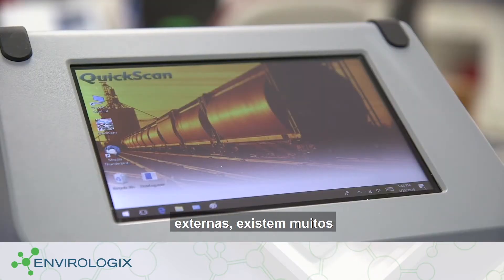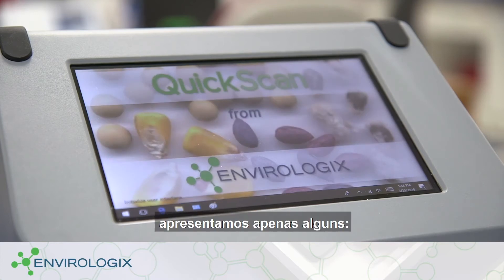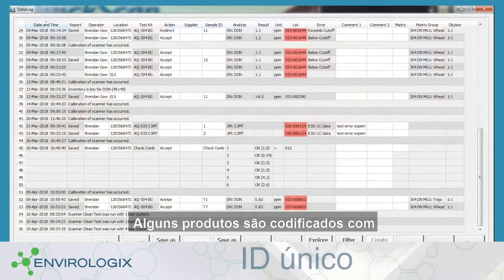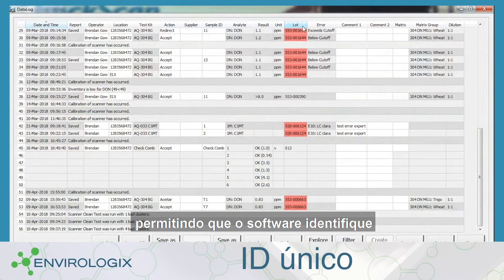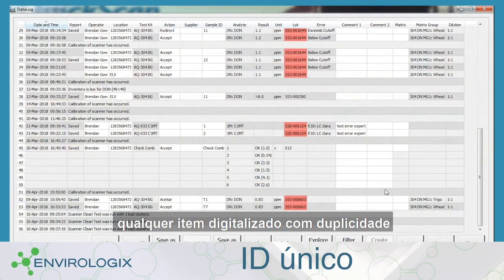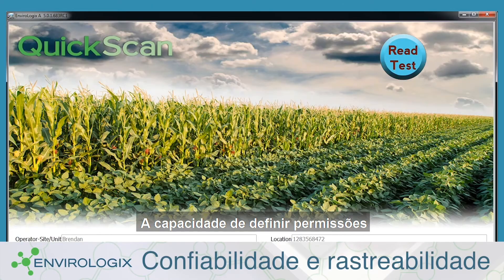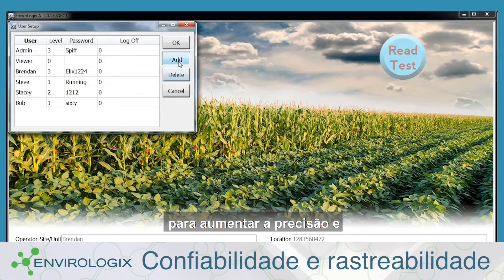Along with physical improvements, there are many new features in the QuickScan software. Some products are encoded with unique serial numbers, allowing the software to highlight any that are scanned more than once. The ability to set permissions and assign user logins is now enhanced by the unique strip identifiers to increase accountability and traceability of results.